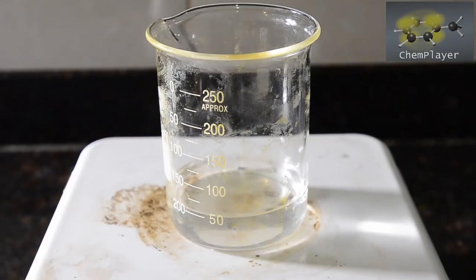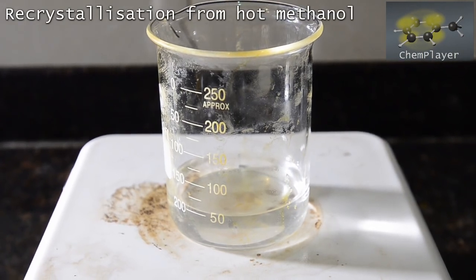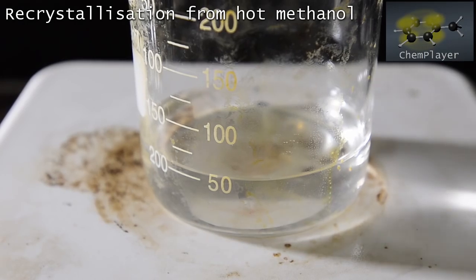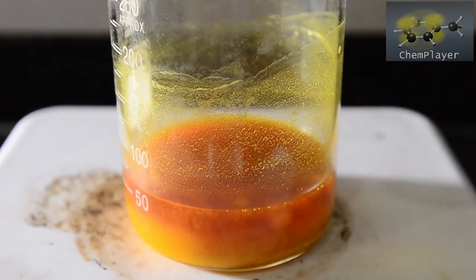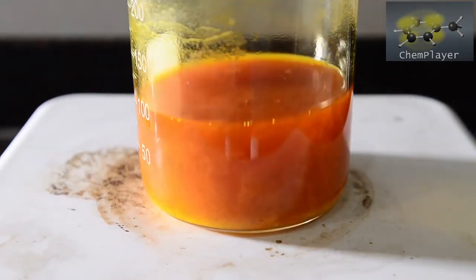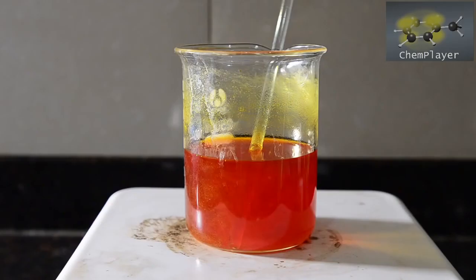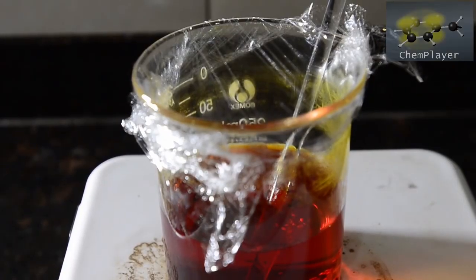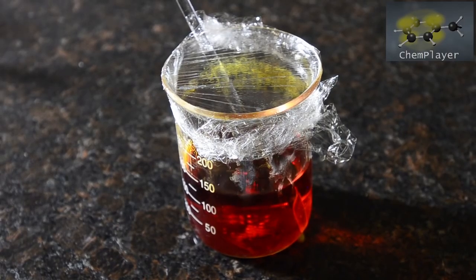To recrystallize our crude product we used methanol. We started with about 50 ml of hot methanol in a beaker and added the crude product. We kept adding methanol and heating the mixture around boiling point. Nearly there. It took about 150 ml to dissolve all the solid, at which point we then covered the beaker and left it to cool down.